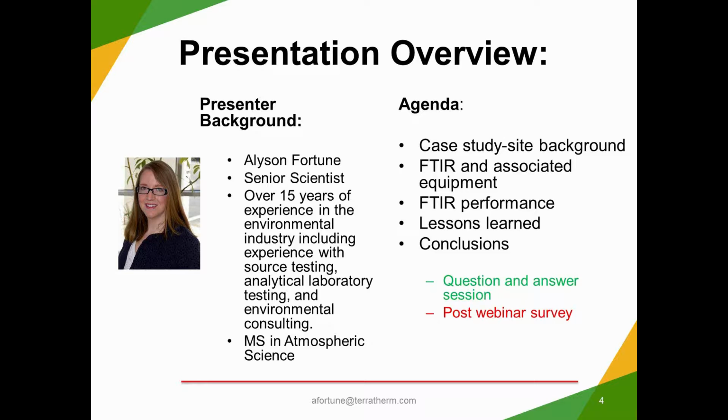at our sites. The agenda today is I'm going to present a case study about a site where we used the FTIR very successfully, and it proved to be a wonderful tool for us. So we'll go through that case study, the site background. I'll explain a little bit more about the FTIR and the associated equipment that we typically use with it. We'll go through this specific case study, how the FTIR performed, as well as lessons learned, and then finally wrapping it up with conclusions.